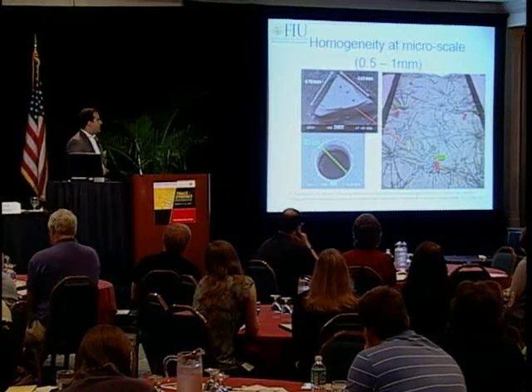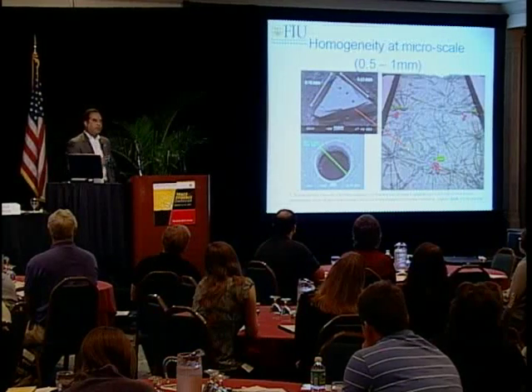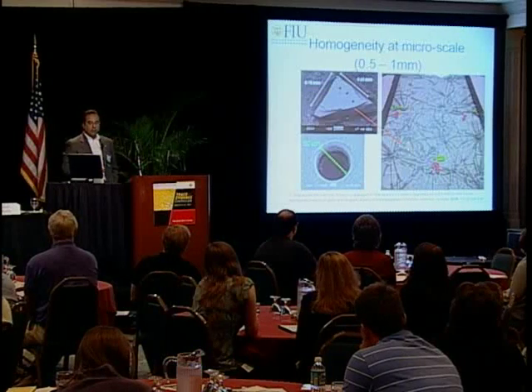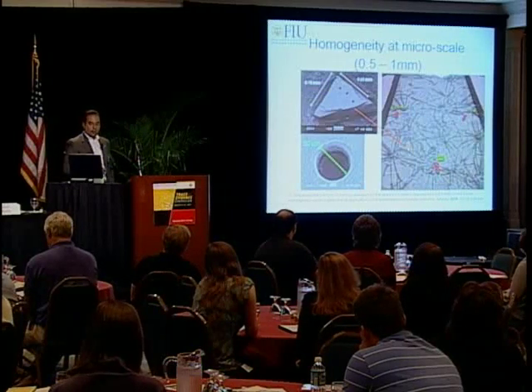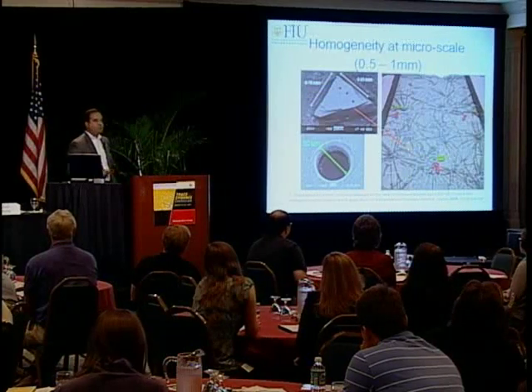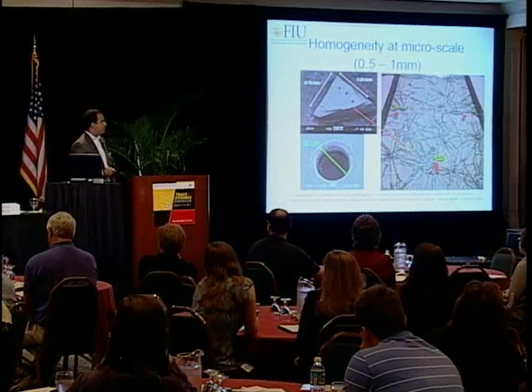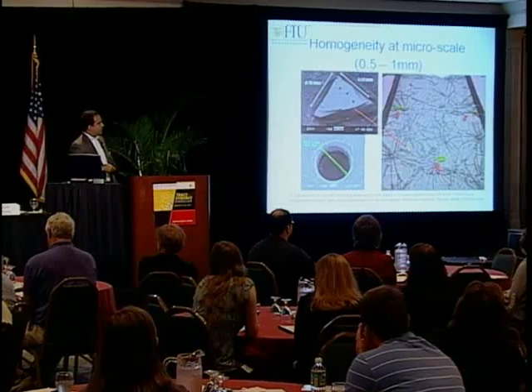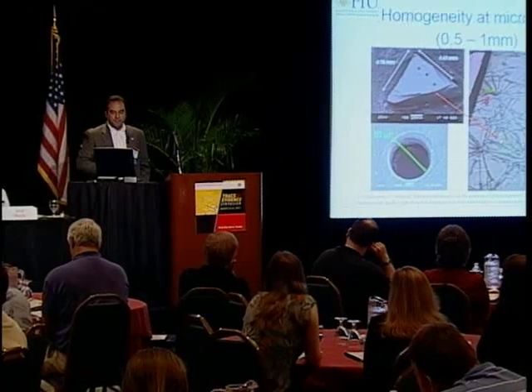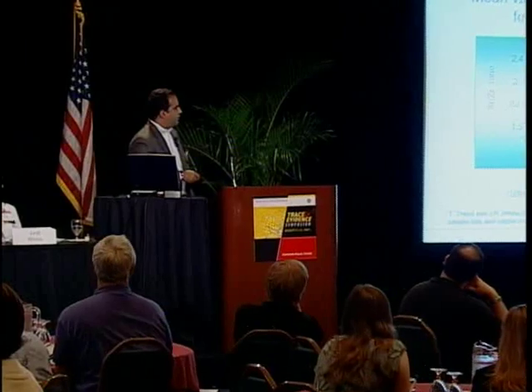So we have done some work in our lab looking at very small fragments. People often ask, well, how small a fragment can you analyze? So this is less than 1 millimeter by 1 millimeter wide and long. The problem is you want to be able to characterize an entire windshield, for example, or an entire bottle. And we'll hear from Karen a little bit later about laser ablation on containers. So you need to sample enough in order to characterize that material. That's very important. So we have some publications related to that.